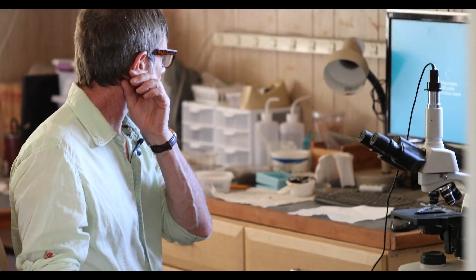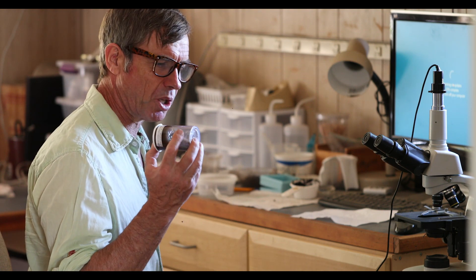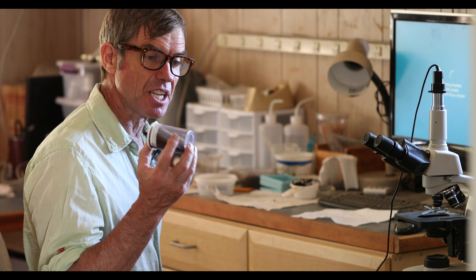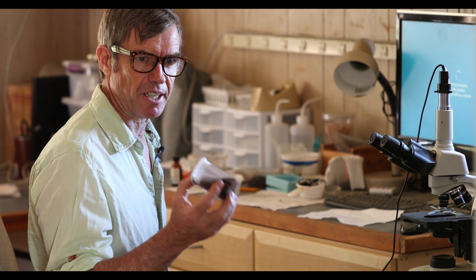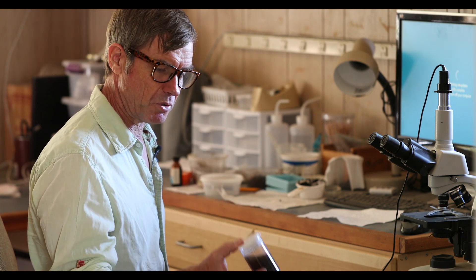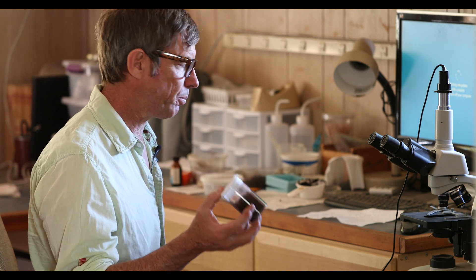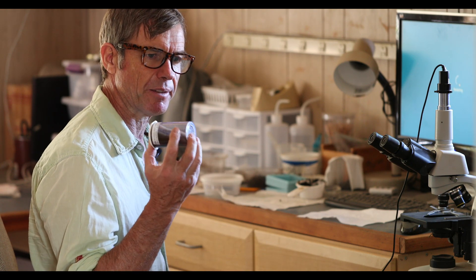We took a sample from our compost — just a small amount — and we diluted it about 1 to 10. We're not actually doing a quantitative analysis today, so it doesn't actually matter the dilution. We're doing a qualitative analysis just to see what we've got in our compost. I'm doing this gentle agitation to get the biology that's in those soil aggregates to go into solution, and then we'll put one drop on a microscope slide and have a look at it.